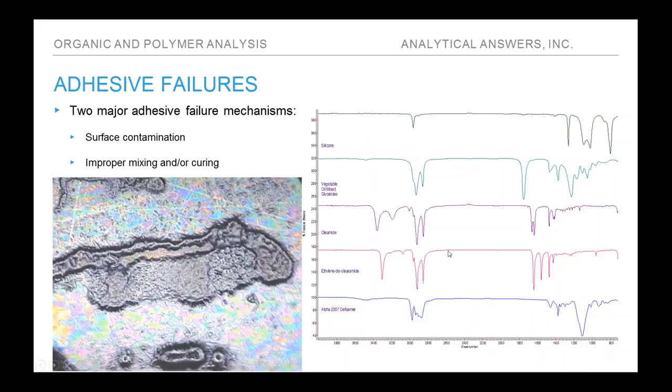The most common surface contaminant causing adhesion failure, shown right up here on the top, is silicone, polydimethylsiloxane or silicone oil, very strong at inhibiting surface bonding. Others we see here as well. We run into quite often fatty acid esters, in this case from vegetable oil, but it would also be from plant or animal oils. The two next down there are oleamide and ethylene bisstearamide.